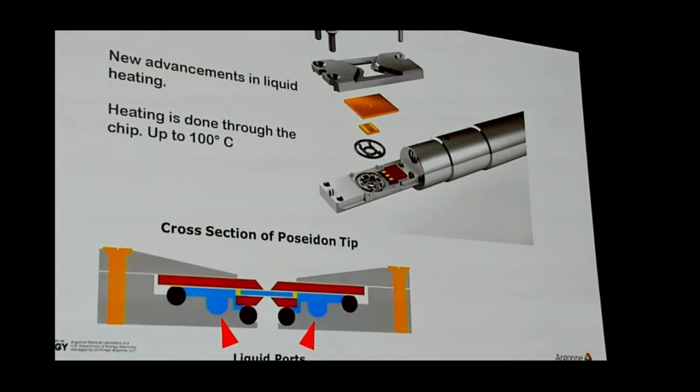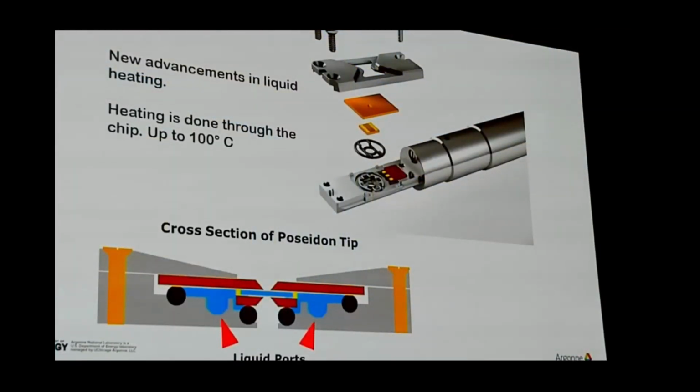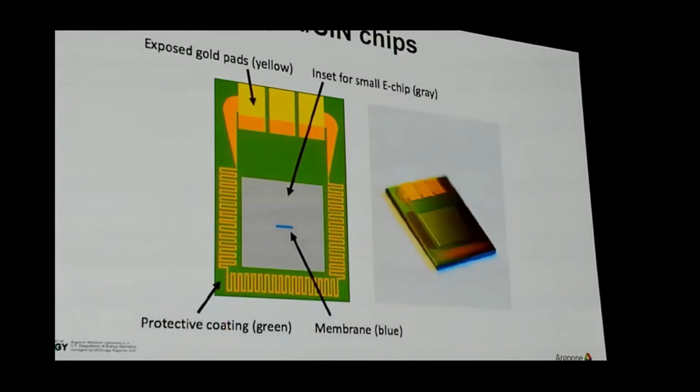at elevated temperatures, and you need to do that at pHs that are not normal either. So it's kind of electron microscopy suicide to put this into your microscope. The pHs here are between 11 and 13, and the temperatures we were able to go up to 100 degrees C. The experiment I'll show you is at 70 degrees C.